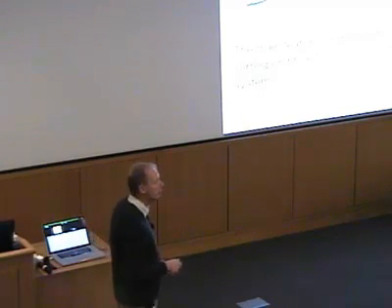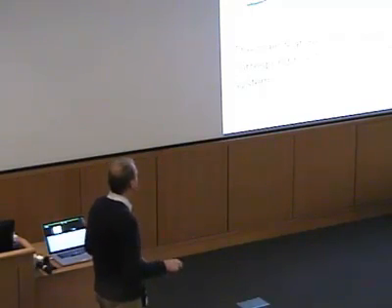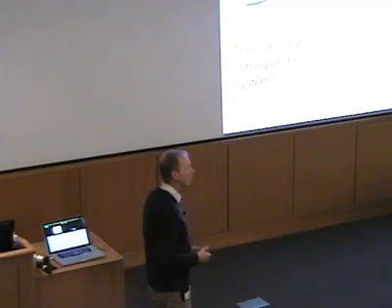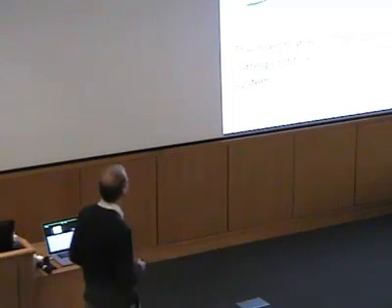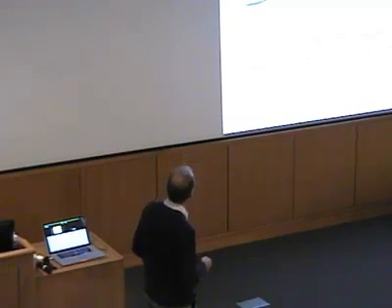rhombicity parameter 0.2 from the rhombogram just by comparing with my spectrum, and I can see that my iron-sulfur cluster, probably not surprisingly, has a relatively high rhombicity. What's more important here, though, is the temperature dependence.